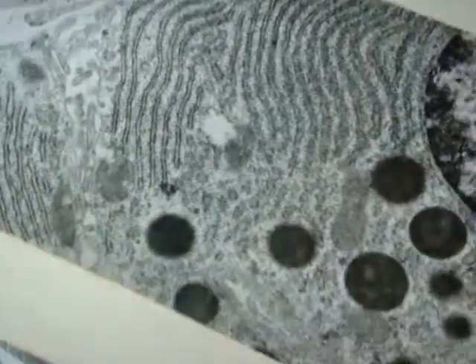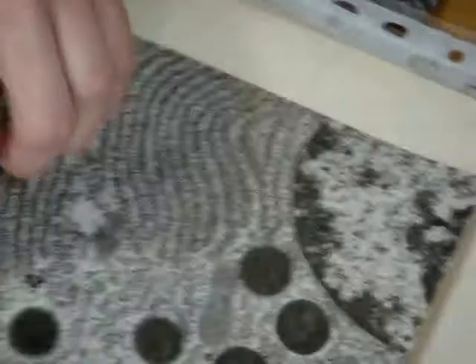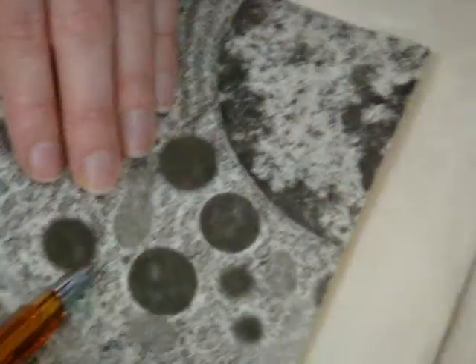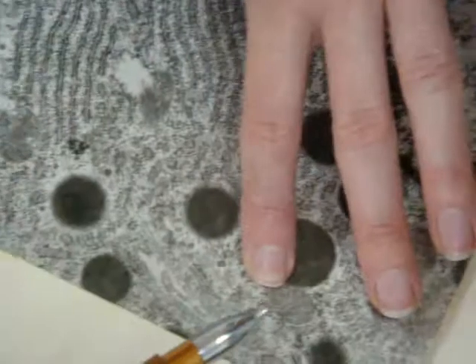We can see one cell, one more cell. These two cells are underlain by basement membrane. These cells are situated close to each other. In the cell we can see a part with rough endoplasmic reticulum, an apical portion with secretory granules, so a polarity sign. So this epithelial tissue is glandular epithelium.